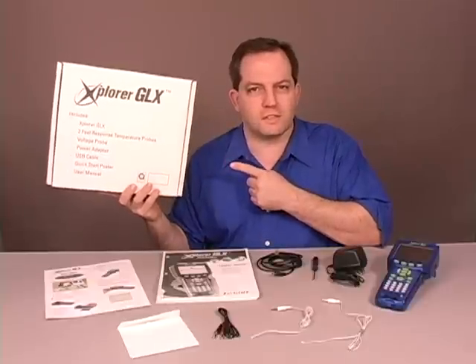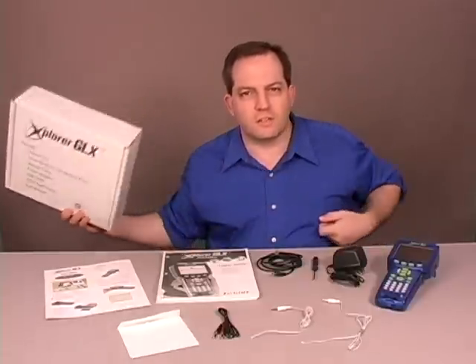The Explorer GLX is your personal science computer. This is the box that your Explorer GLX comes in. Let's take a look at what's inside.